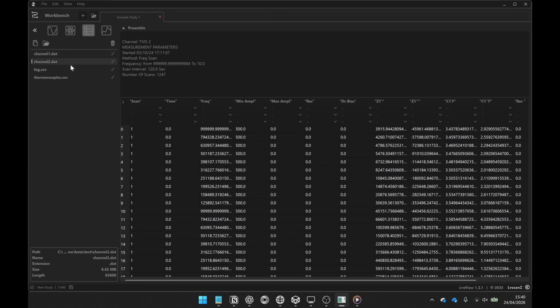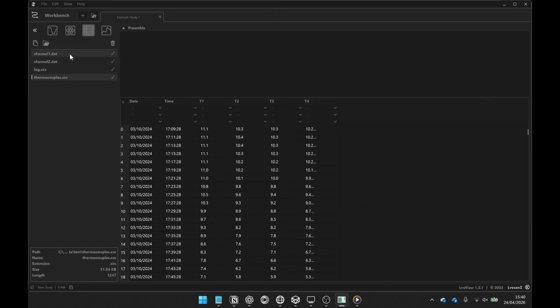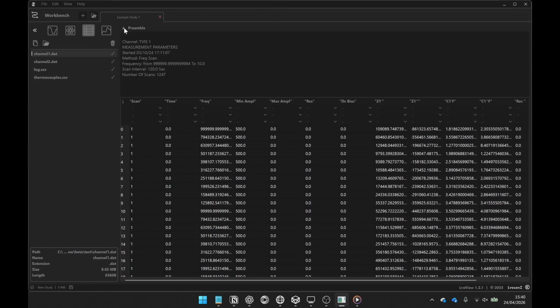Imported files are processed and their metadata is compared with a series of pre-configured schema, which allows parameters to be extracted accordingly for each dataset type. These are automatically computed and passed to the parameter module where they are displayed.